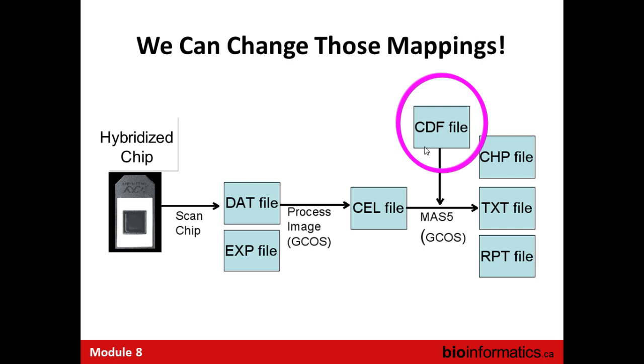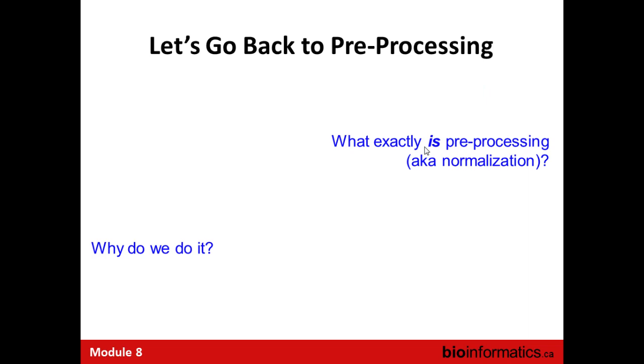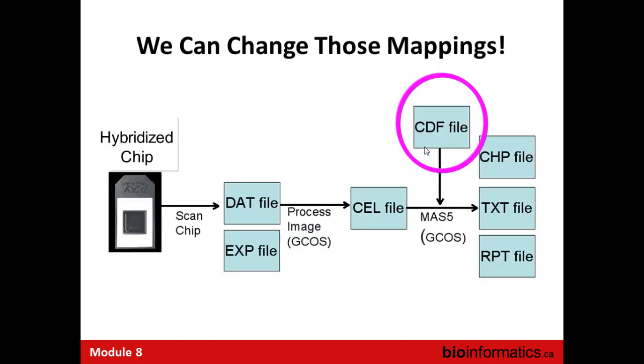All the probes, both control and non-control, are related to genes. And all you have to do is update that. Probes around the world do that. Basically, they'll go ahead and realign all of the probes to new locations and update that. Using a proper CDF file is the single biggest identifier of an array experiment being well analyzed.